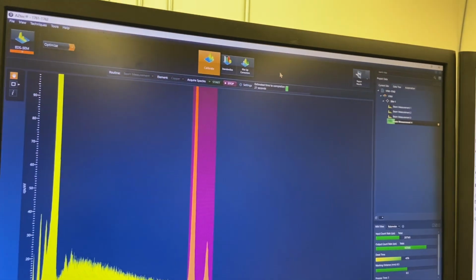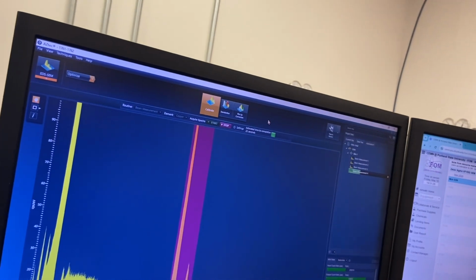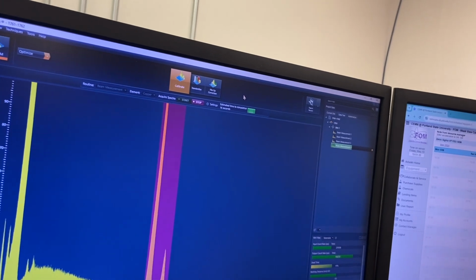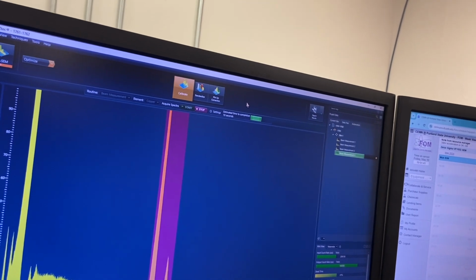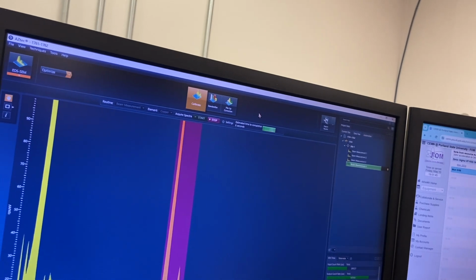And when you change your current, you're changing how many electrons there are that could interact with your samples, and then that changes things like counts, and it affects stuff like standardization, especially if you're measuring intensities of X-rays for certain elements. So it's always good when you do any microprobe work to know what the beam current is. But for this, we're not too focused on that.